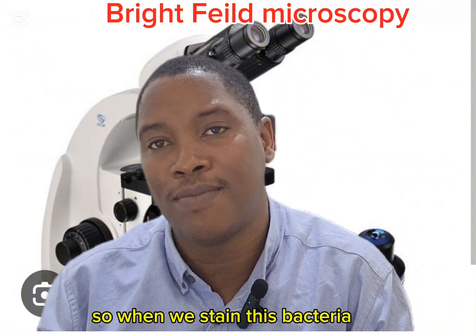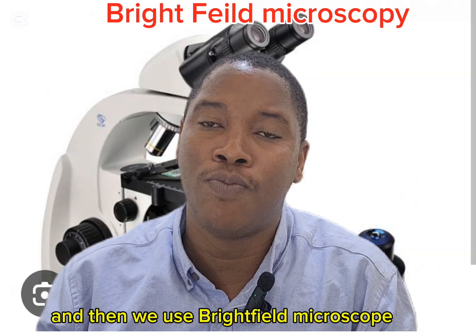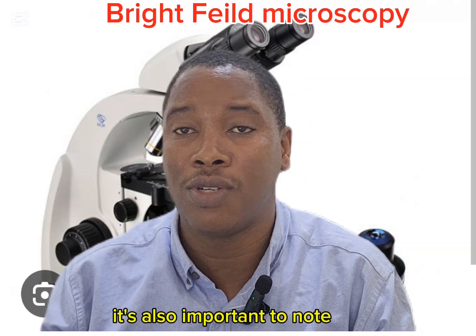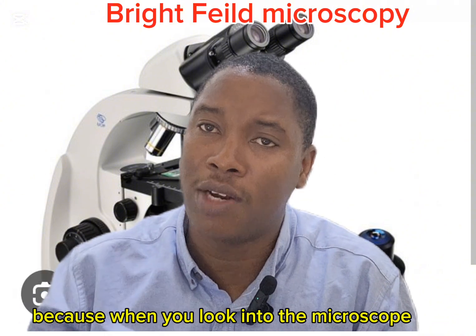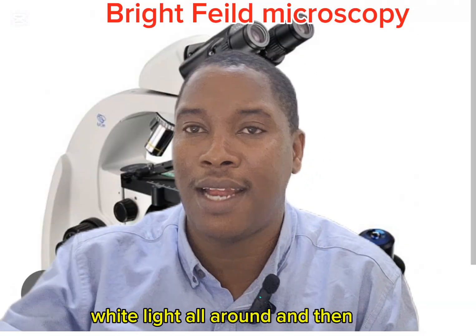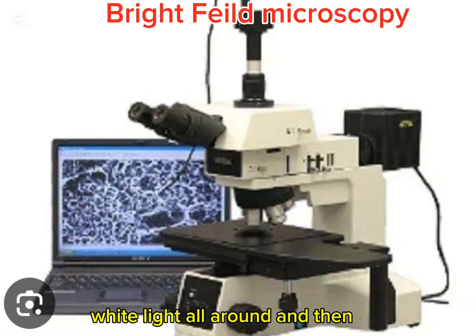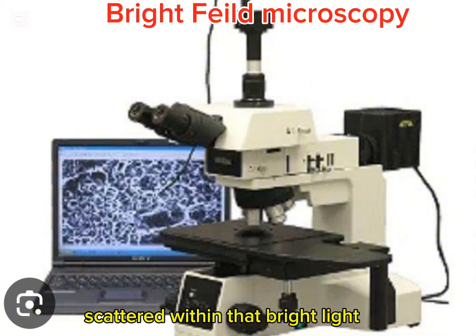When we stain this bacteria, we mount it on a stage and then we use the bright field microscope. It's also important to note that it's called bright field microscopy because when you look into the microscope, you notice a bright white light all around, and then you have your sample in the middle or scattered within that bright light.